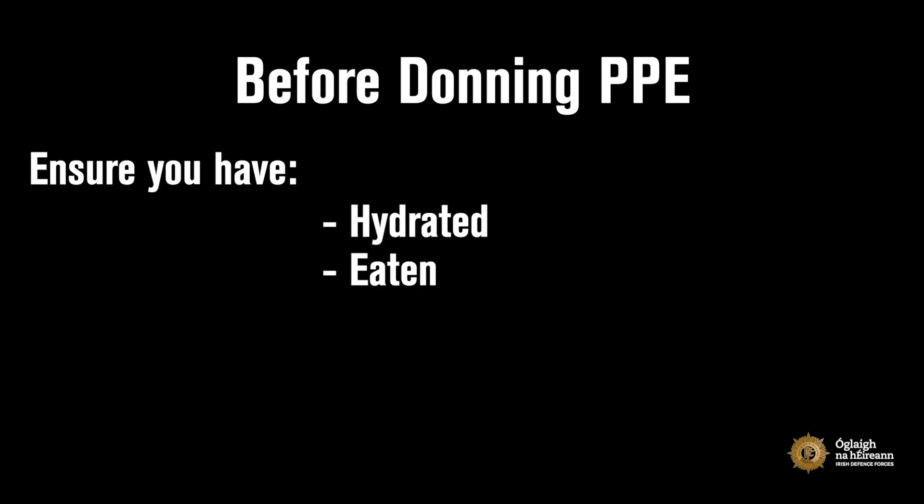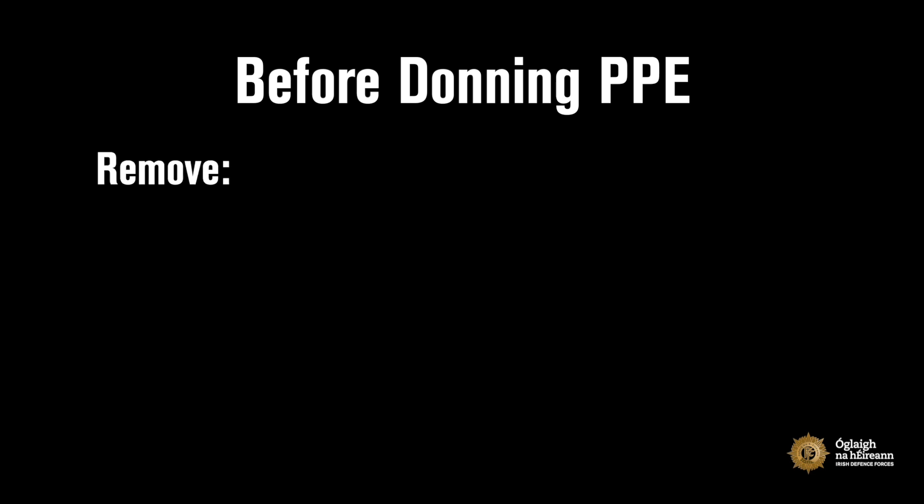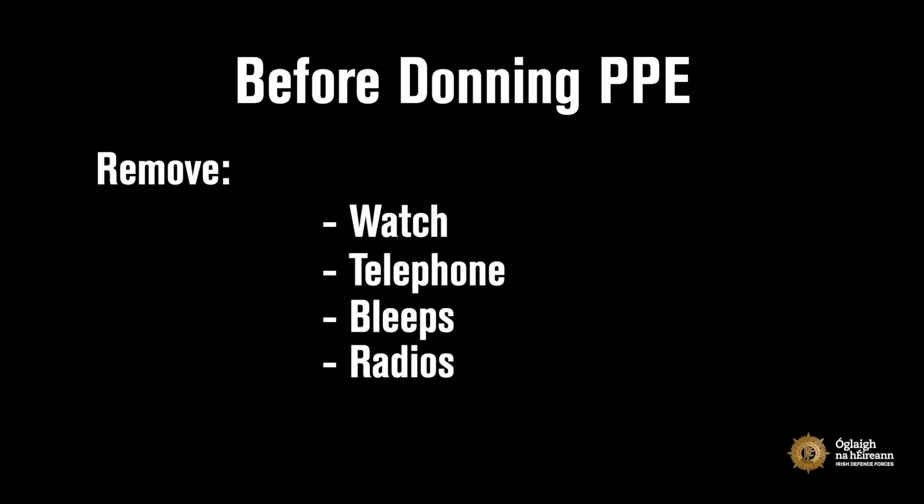Before donning your PPE and entering a clinical or operational area, ensure you are adequately hydrated, have eaten and are rested. Use the bathroom or take any medications you may require. Remove any distractions such as watches, telephones, bleeps or radios.